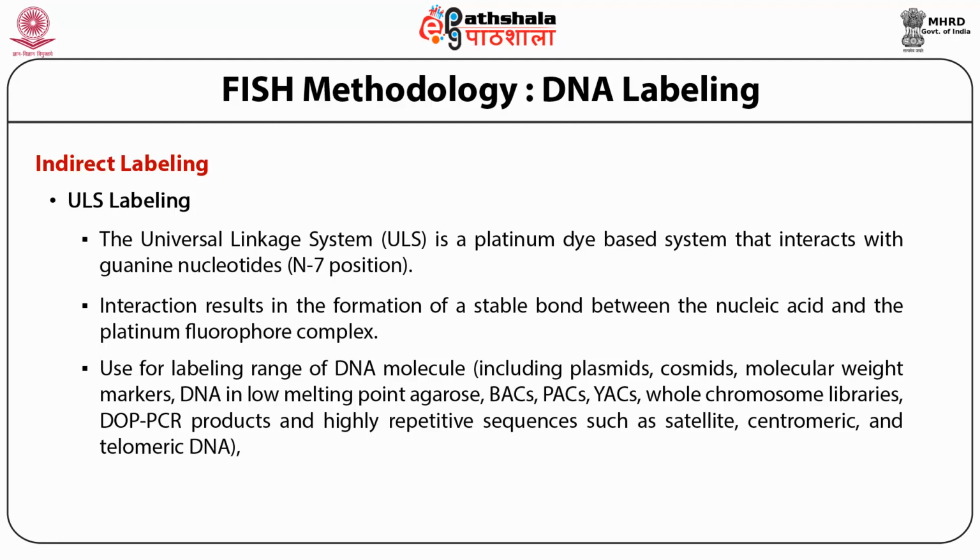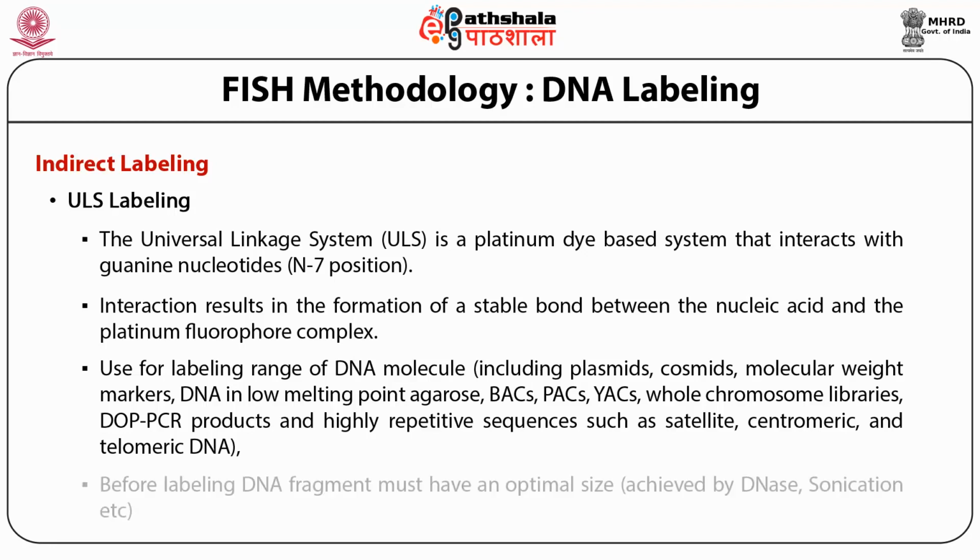However, the important and crucial factor in this method is that we need to optimize the DNase treatment or the DNA fragmentation method, which could be achieved either by DNase or by sonication, because we need an optimal size or optimal length for the DNA molecules that can be used for the subsequent reaction.